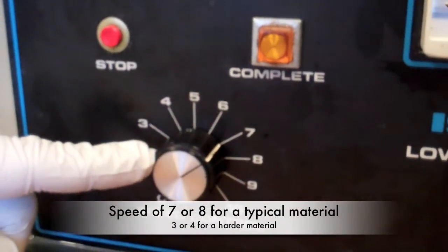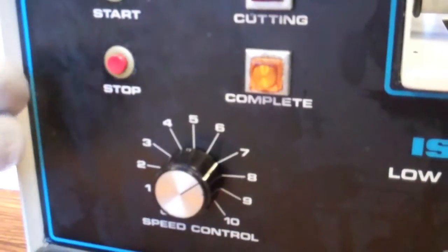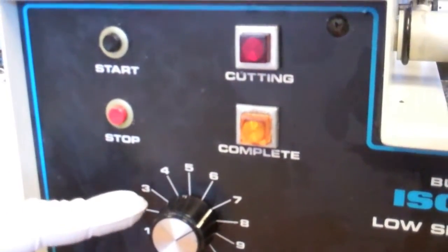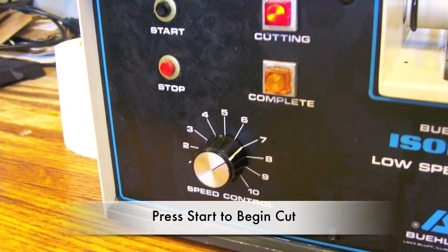Typical speeds for cutting soft materials are between 7 and 8 and 3 or 4 for a hard material. If the speed is too high for a hard material, the circuit breaker will pop and the machine will have to cool and reset. To start the cut, press the start button.